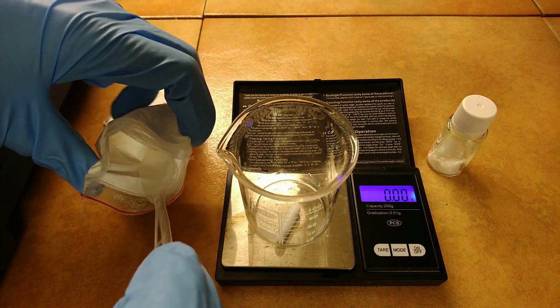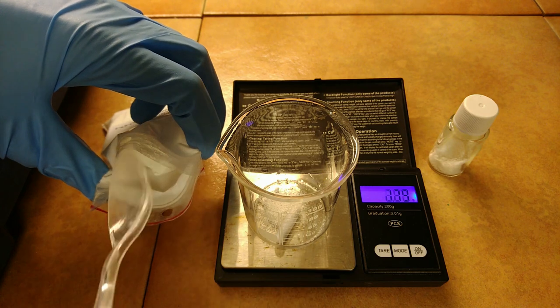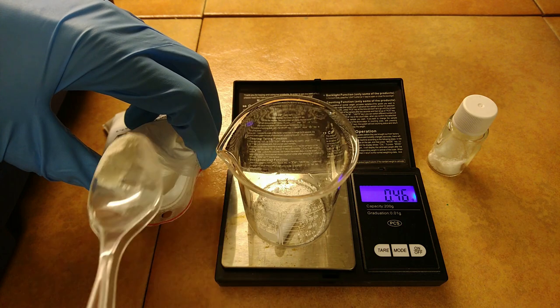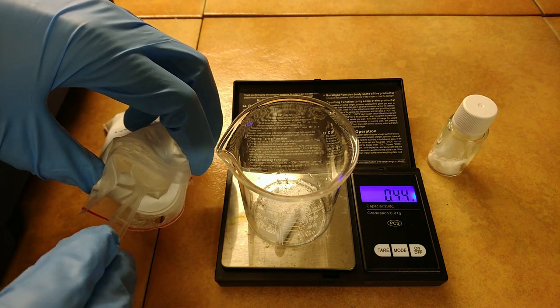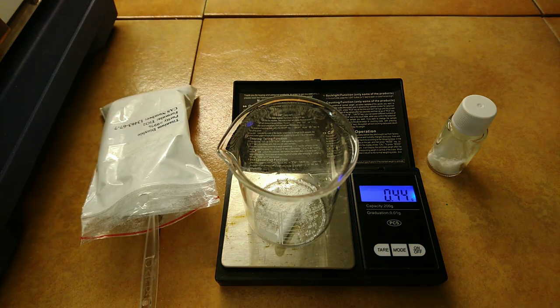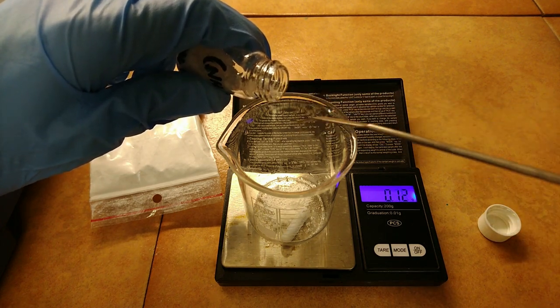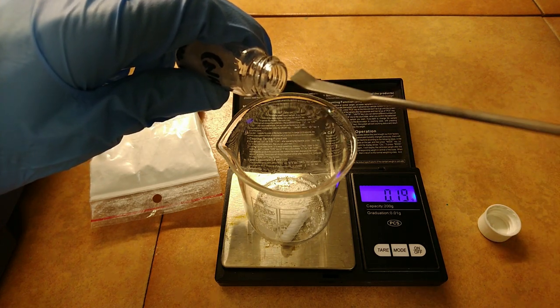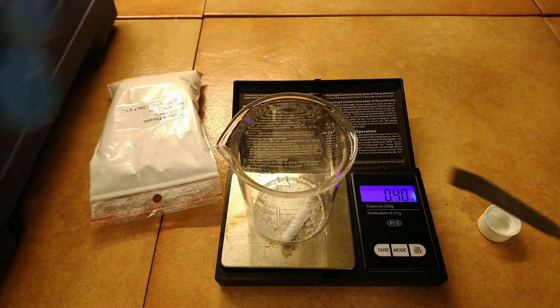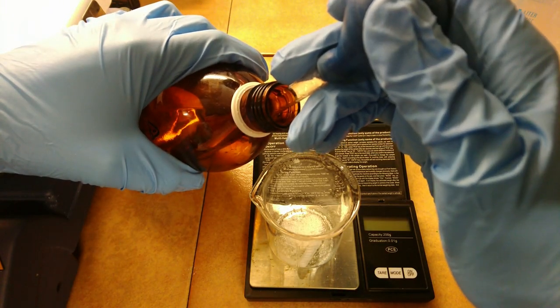To start, prepare a beaker with a stir bar and heat. Add 0.45 g of titanium dioxide, then add 0.45 g of ammonium sulfate. Finally, add 12 ml of concentrated sulfuric acid.